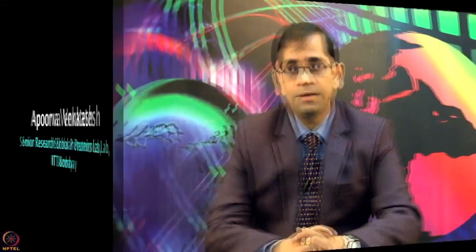Today we are going to continue the demonstration and also show you the ways to do data normalization and how to do microarray data analysis, specifically if your goal was to look for a biological question of interest. In this case, we are going to talk about several ways of how to make meaningful data from the patients who are suffering from malaria using protein microarray based platforms. So, let us have this lecture and demonstration session today.